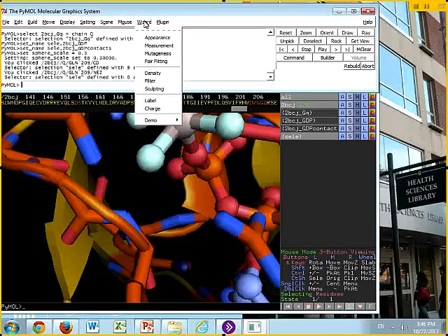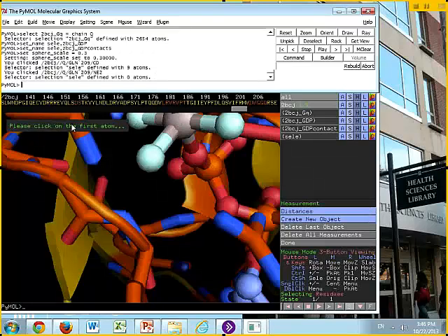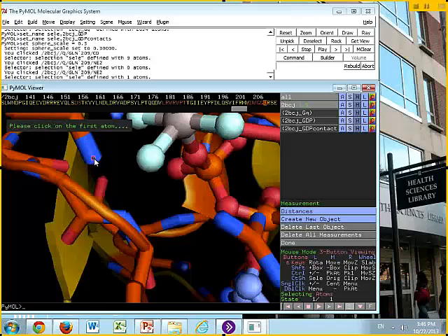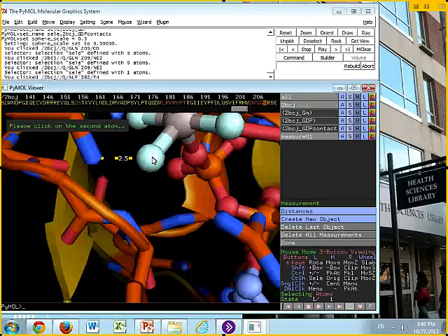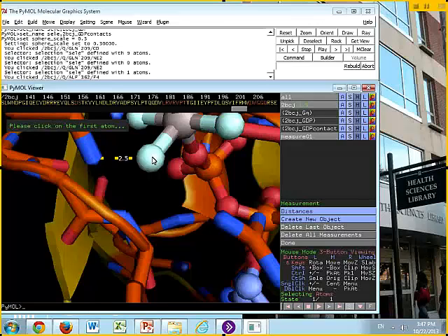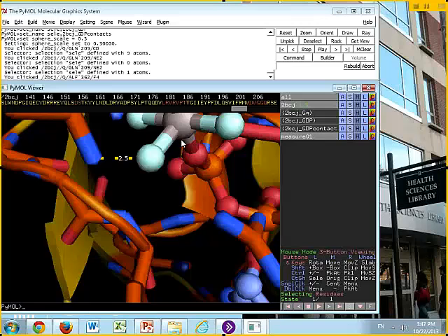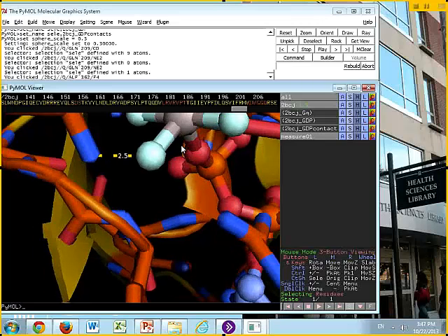We come up here to wizard, and we're going to turn on measurements. As soon as you do that, you'll see the option to please click on the first atom. I'm going to click on this atom, and then it says please click on the second atom, and I'm going to click on that atom. Sure enough, it puts the dashed line there with the distance 2.5 angstroms. Any distance smaller than 3.2 angstroms, generally, 3 to 3.2 would be considered a hydrogen bond. If it gets small enough, less than 2.5, you have to start wondering if it's more than a hydrogen bond, is it a covalent bond? That 2.5 is a good, strong hydrogen bond. Then we can say done.